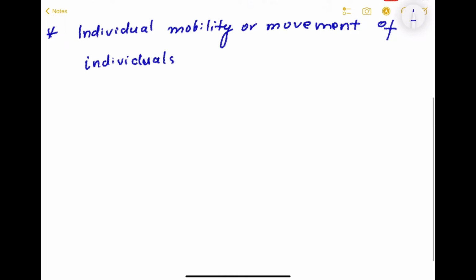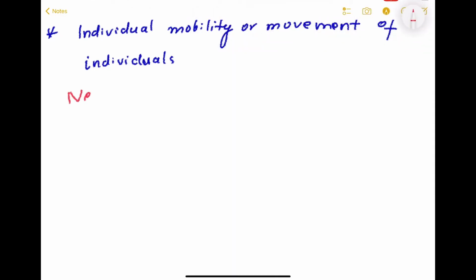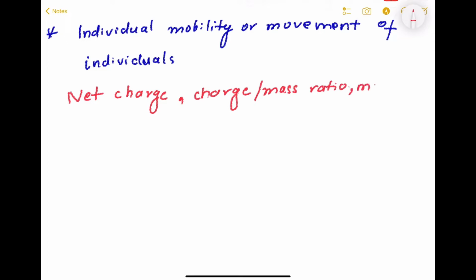These factors are net charge, charge mass ratio, molecular shape, temperature, porosity, and viscosity of matrix.